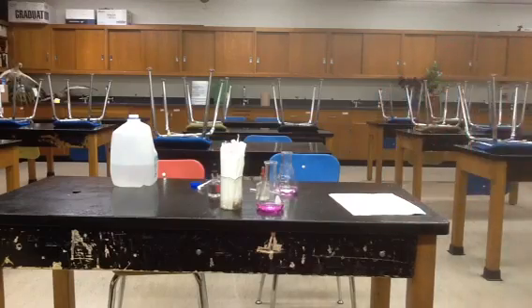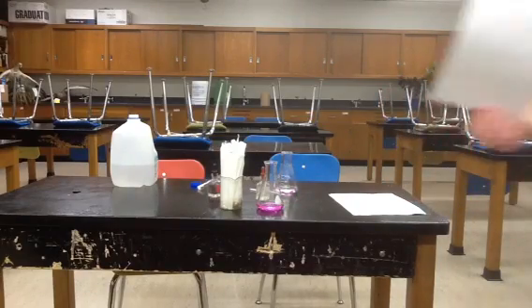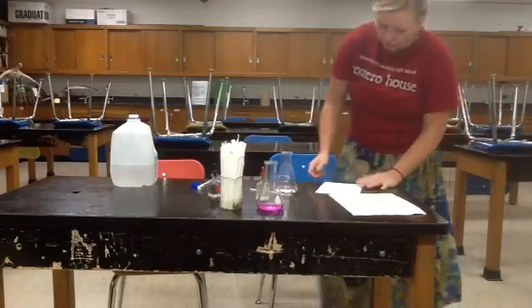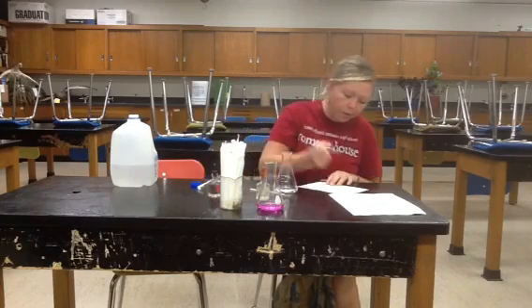Then you're going to get your data sheet, which is this right here. You'll have it in front of you. And on your data sheet, you're going to record the number of drops of sodium hydroxide that you put in at rest. So in this case, I put 1 drop. Okay?